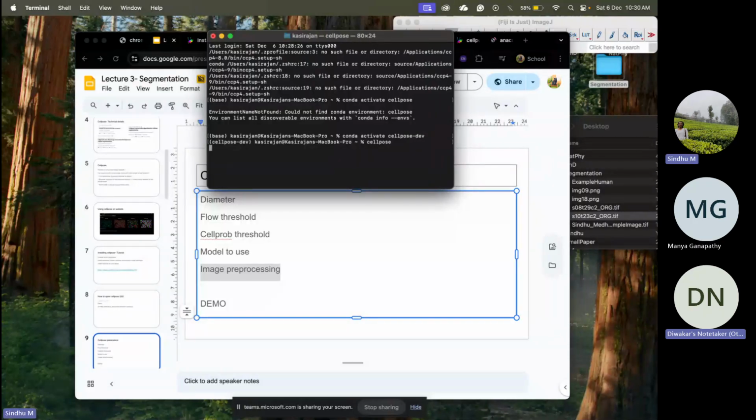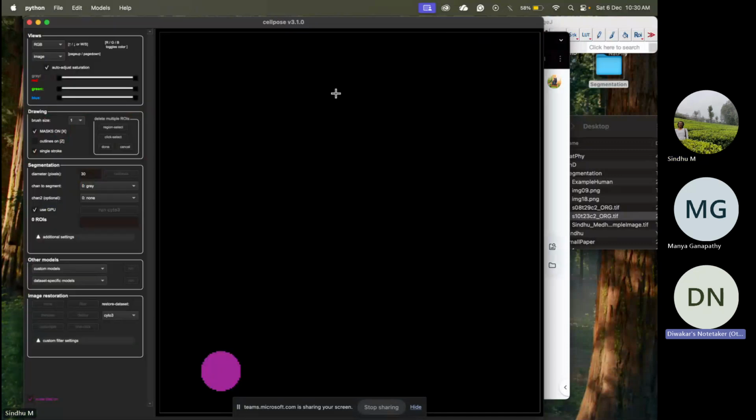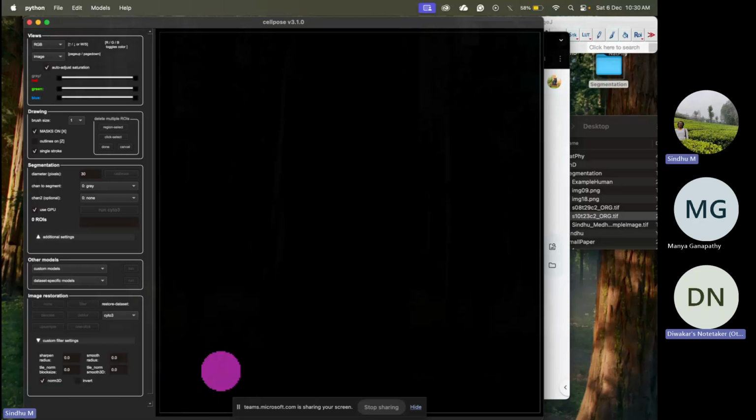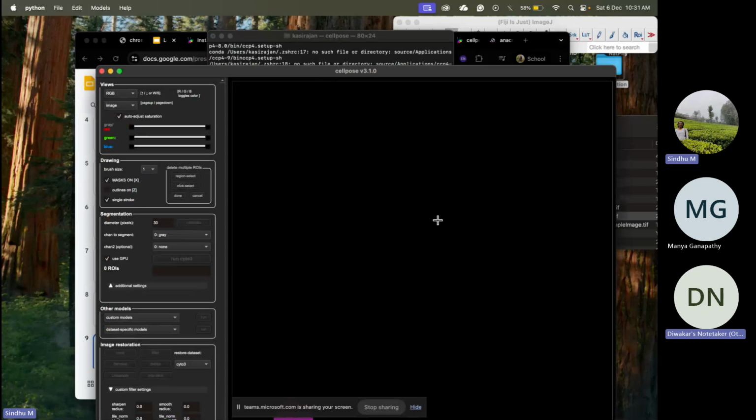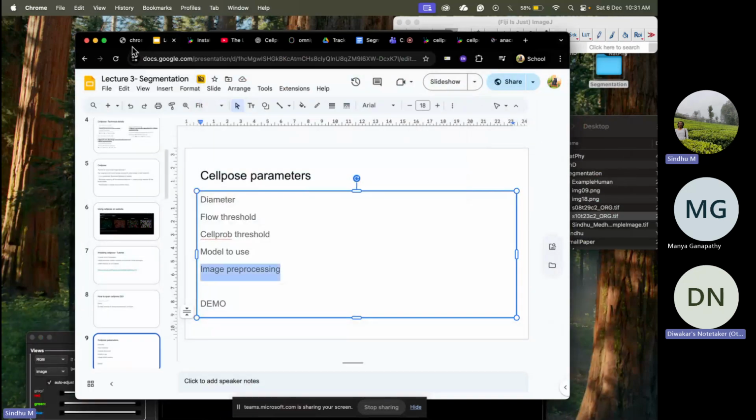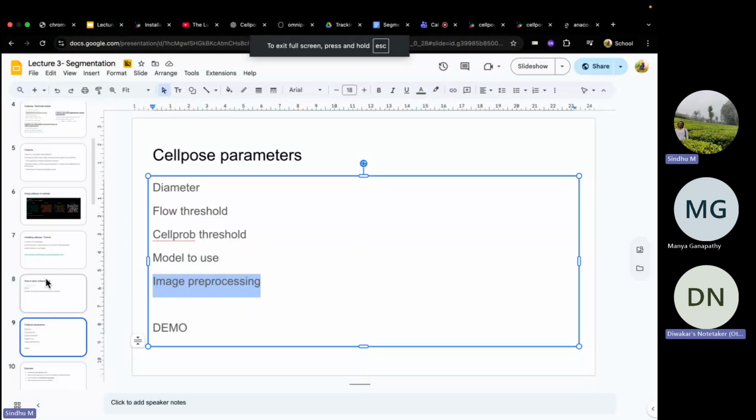It is there in the very bottom part of it. Here there are different settings that you can use to pre-process the image and then segment it. For example, if you upsample or sharpen, then if the image is not clear and the boundaries are very blurred, when you sharpen it, it will increase the boundary clarity a bit more.